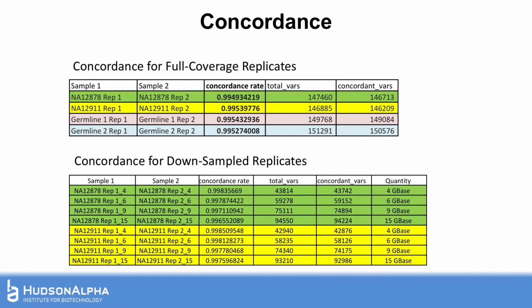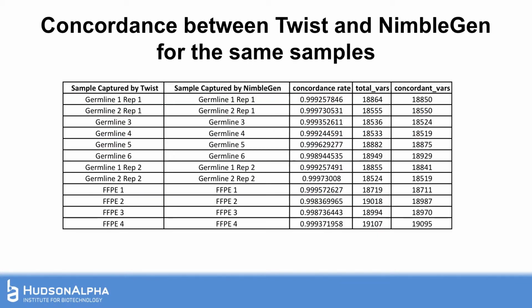Now, some of you may be wondering, why isn't it 99.9% or so? And a lot of these are intronic variants. Certainly, there's some spurious results because of alignment issues in some of those regions of the genome. So if you instead restrict it to a concordance where we look at only overlapping bed file regions of two different capture products, one being the Roche NimbleGen product, and this one being the Twist product, you again now see those 3 nines of concordance across a smaller space of variants. Again, looking at only the overlapping, or essentially the overlapping protein coding regions of the exomes here, and then we see those concordance rates jump back up as expected.